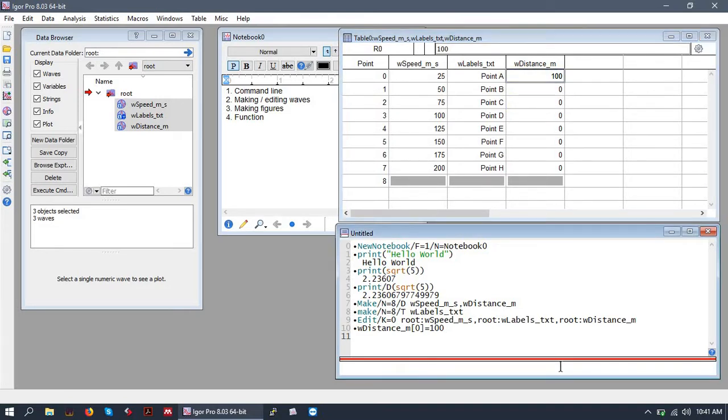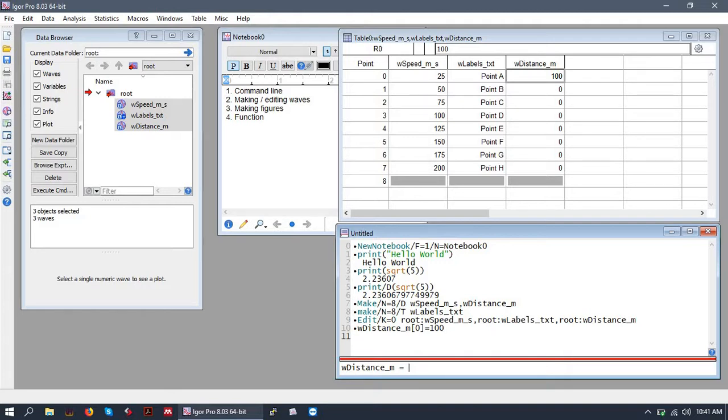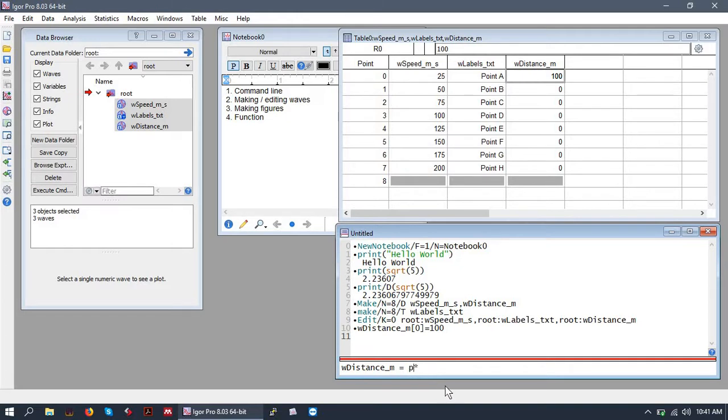One way to do this from the command line is to edit our waves similarly to before except do not include a bracket, simply type the name of the wave and use the index value. I forget what it's called but basically Igor has these letters P for rows Q for columns and I don't know what for the other dimensions but this P basically means at each point give us the point value.